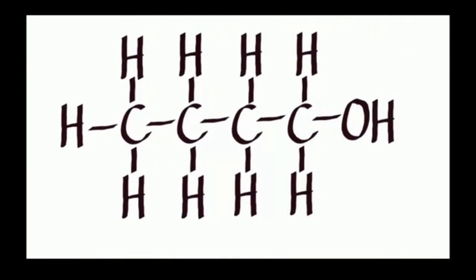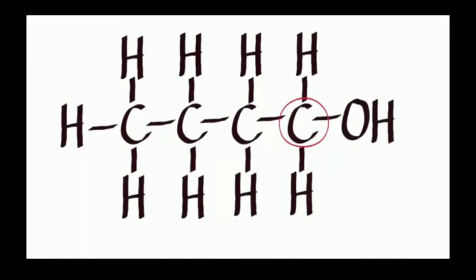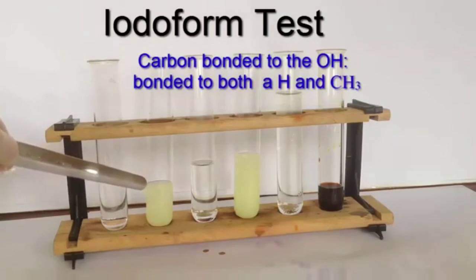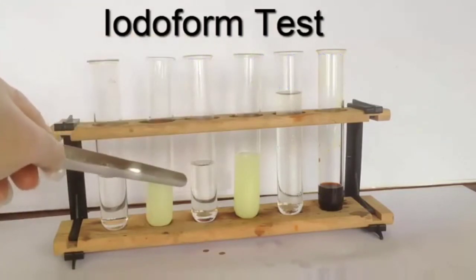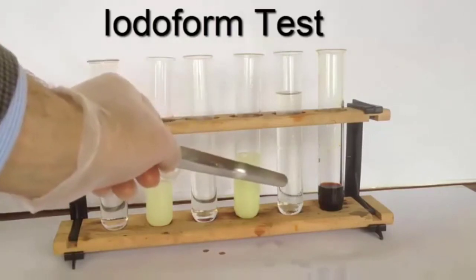Here's the structure of butan-1-ol. There's the carbon that's attached to the OH. You can see that it does have a H attached, but it doesn't have a methyl group. It has a propyl group instead, and that won't do. So that's why it was negative, exactly what one would have expected. So that's the ethanol. We had a positive test with that, and we had a positive test with propan-2-ol there. We had a negative test with propan-1-ol, and we had a negative test with the butan-1-ol.